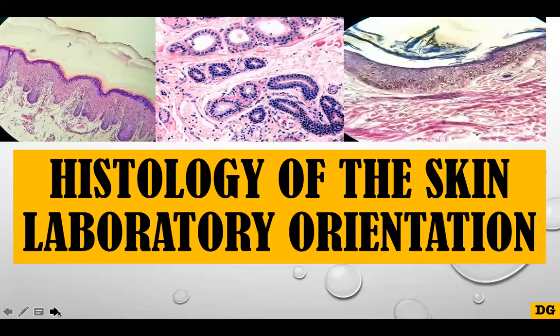Alright, and that concludes the laboratory orientation of the histology of the skin.